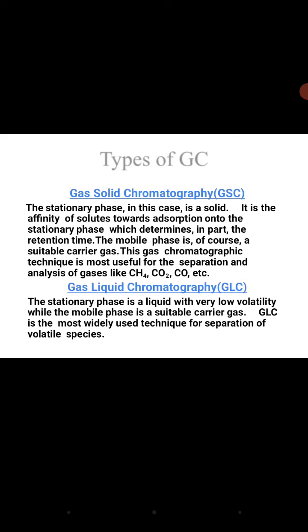Gas liquid chromatography. The stationary phase is a liquid with very low volatility, while the mobile phase is a suitable carrier gas. GLC is the most widely used technique for the separation of volatile species.